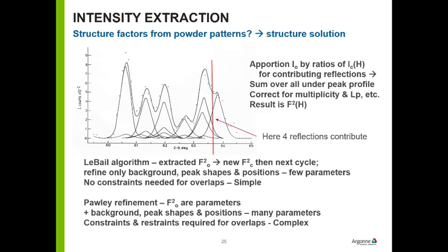Say here and here and here. You can't tell the intensity contribution from each one of those. So you have to do something to deal with the fact that you've got overlaps. That makes this particular fitting rather complicated because you have to be able to reduce parameters, get rid of the ones that overlap exactly. Otherwise, the least squares are going to say, no, singular matrix, bang, and you get nowhere.